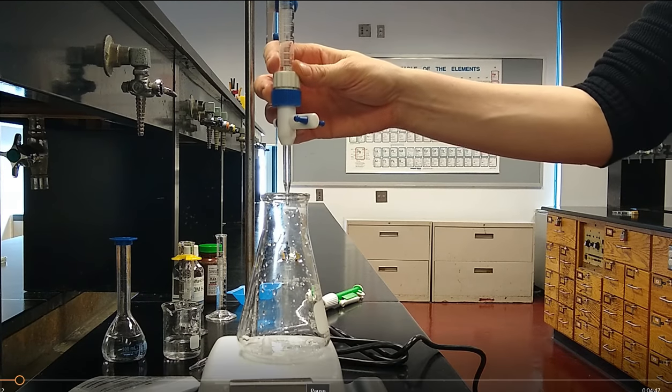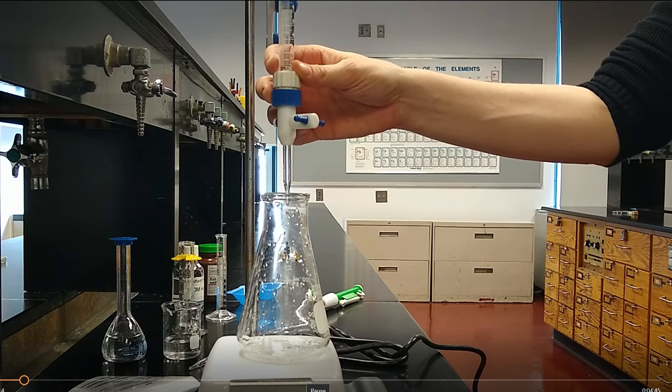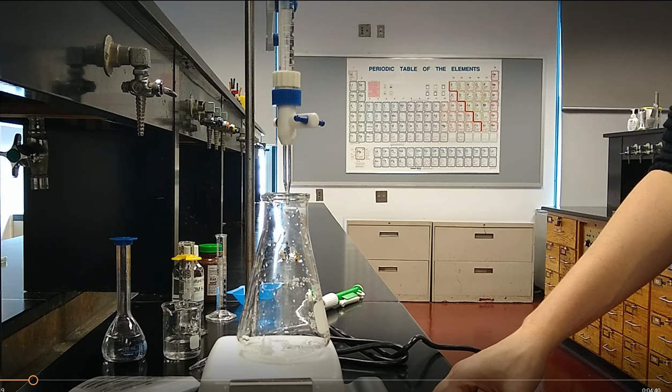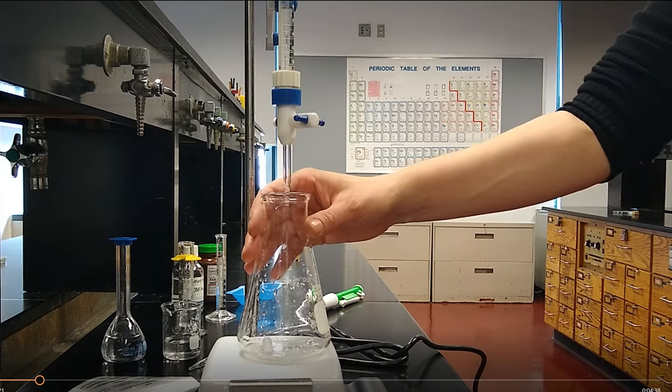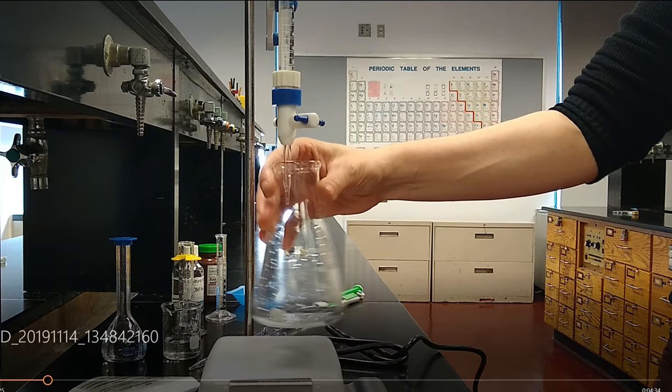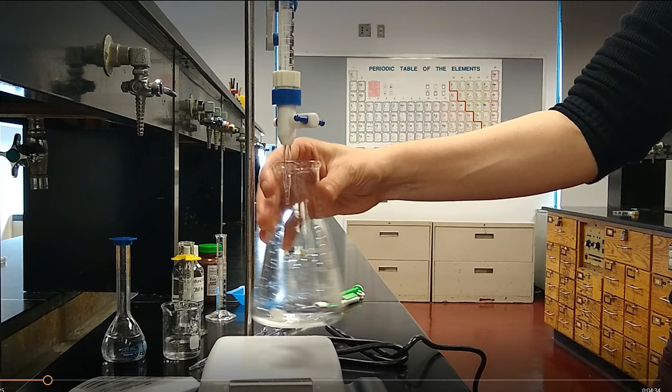The other part of this setup is a really familiar piece of glassware. Hopefully by now you are aware that this is called an Erlenmeyer flask. We use an Erlenmeyer flask because it prevents splattering. If you're able to swirl around the solution, hopefully none of it spills out. We'll be using the stir bar so you're not going to have to do excessive swirling, but it avoids splattering and that's why we always use this type of glassware for titration.